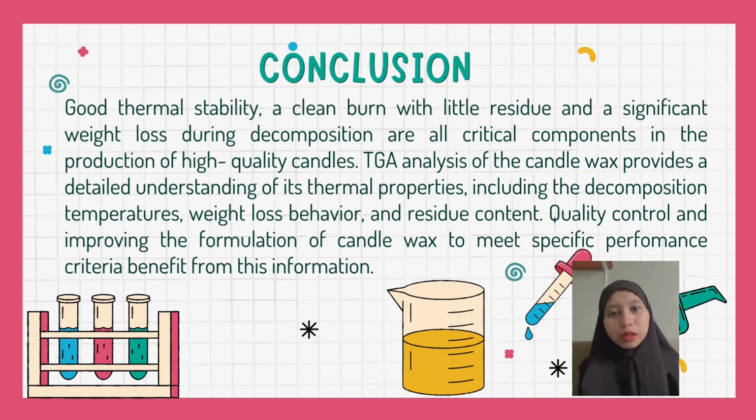Finally, I want to explain about the conclusion. Good thermal stability, a clean burn with little residue, and a significant weight loss during decomposition are all critical components in the production of high-quality candles. TGA analysis of the candle wax provides a detailed understanding of its thermal properties, including the decomposition temperatures, weight loss behavior, and residue content. Quality control and improving the formulation of candle wax to meet specific performance criteria benefit from this information. That's all from me.